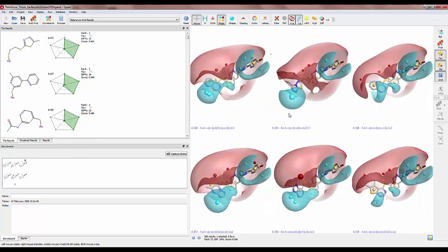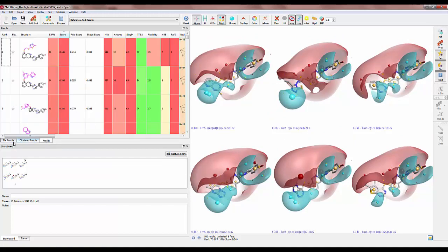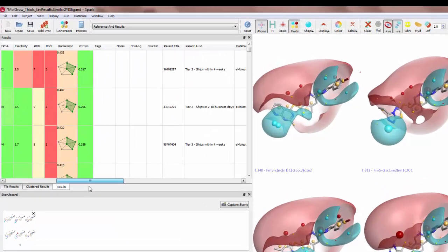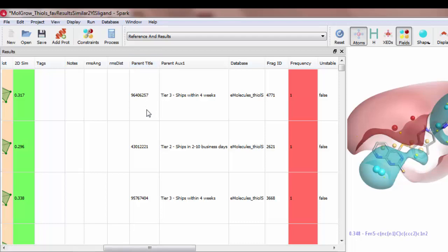If I want to order any of these reagents I can scroll across the results table, find the e-molecules ID and the tiering information.